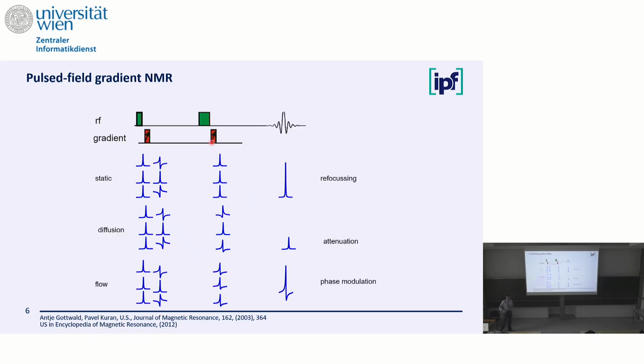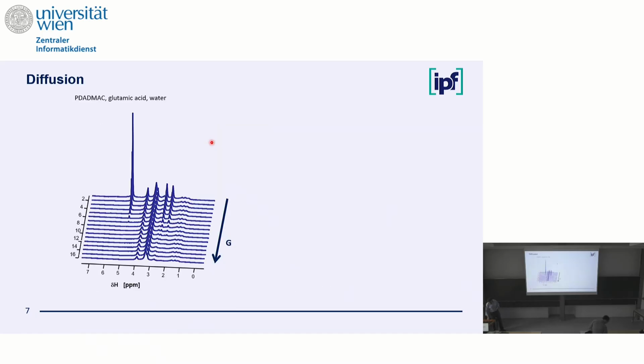The situation becomes different when the spins move in the same direction, the same distance during that time. And the phase error for every spin package is the same. Integrate, I get a full amplitude signal, but I get a phase distortion. From that phase distortion, I can also work out the displacement. I know the time.